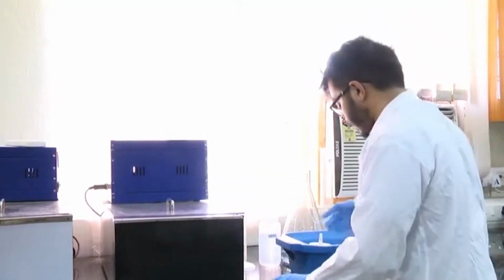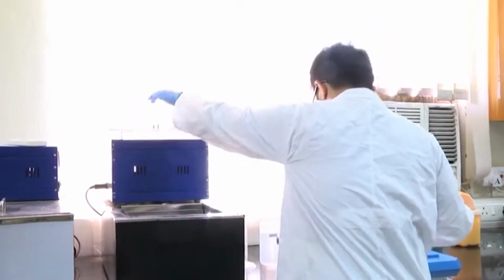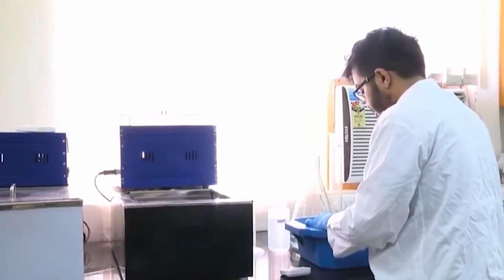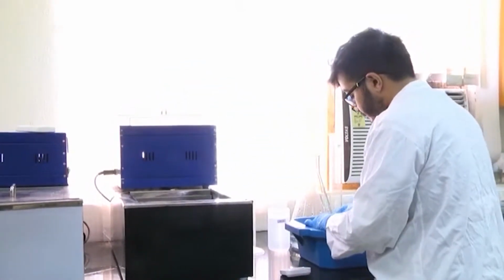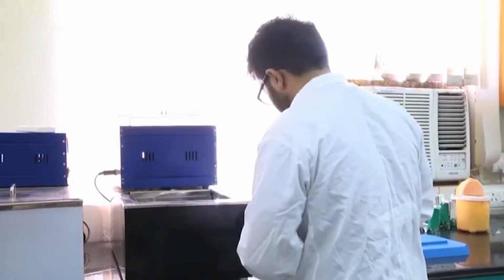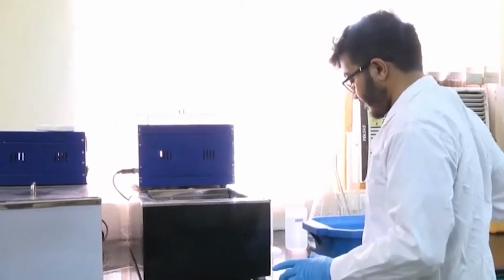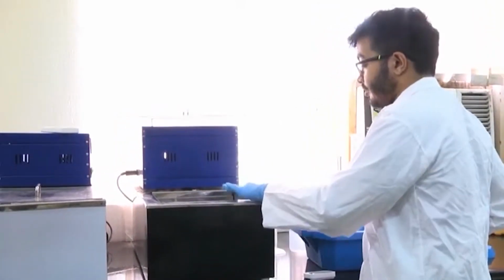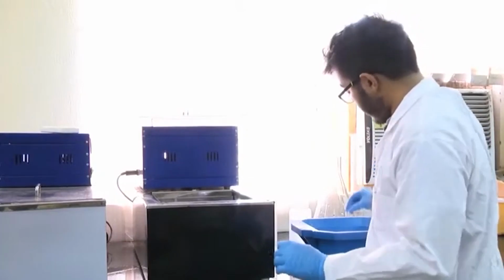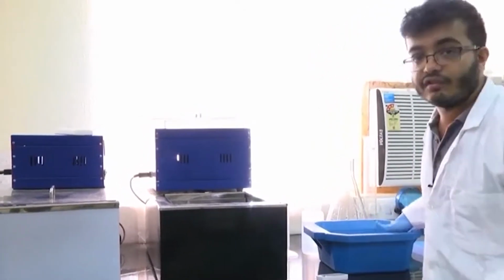So, my timer is set up. I will just remove the lid for the water bath, and the vial which contained the mixture of DNA and competent cells, I will just leave it in water, and I started my timer. Once 45 seconds is over, since this is at 42 degrees, I will just take it out and put it back in ice to let the bacterial cells recover.